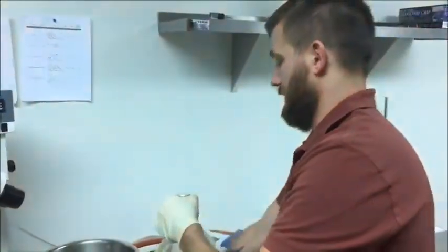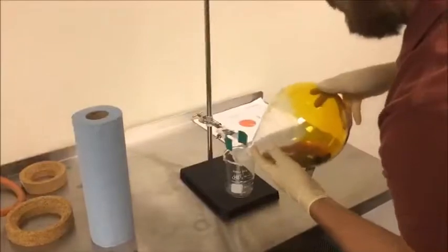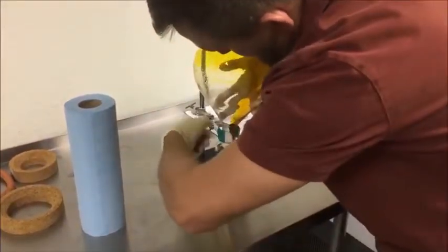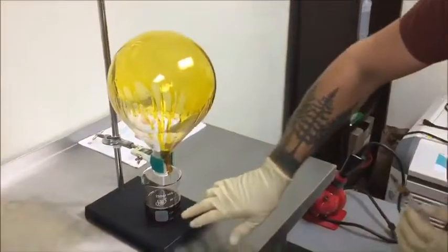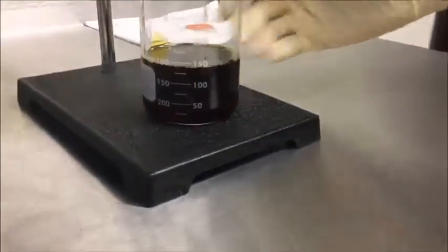Now we want to get it all, put it into a beaker. I'm going to turn this upside down and let it sit. Tighten this up. So here our oil is dripping out of the flask. I went ahead and took a small sample, so you can see in the flask it looks kind of dark. It's still pretty transparent. I can see all the way through it. It's hard to see on the camera.